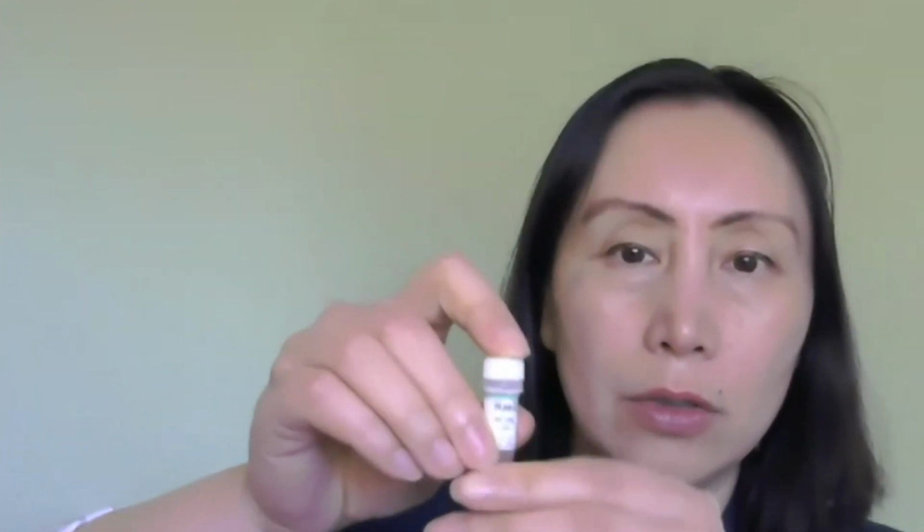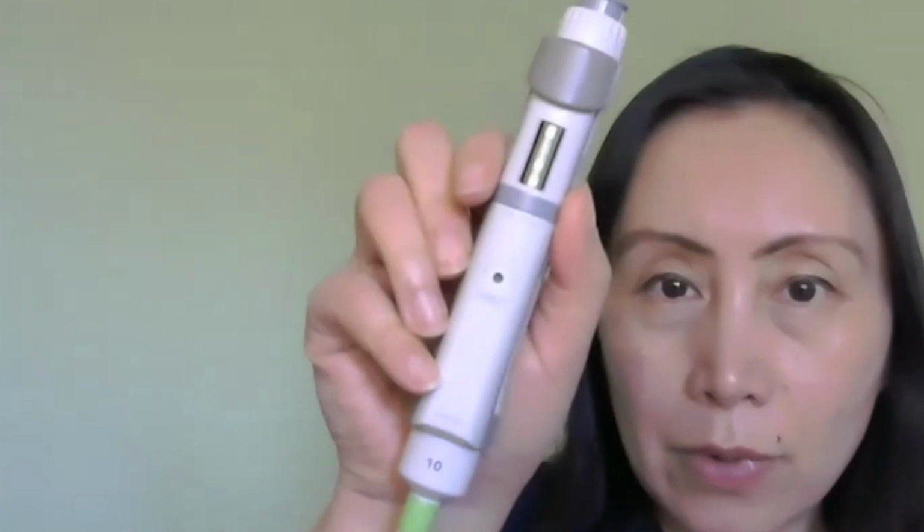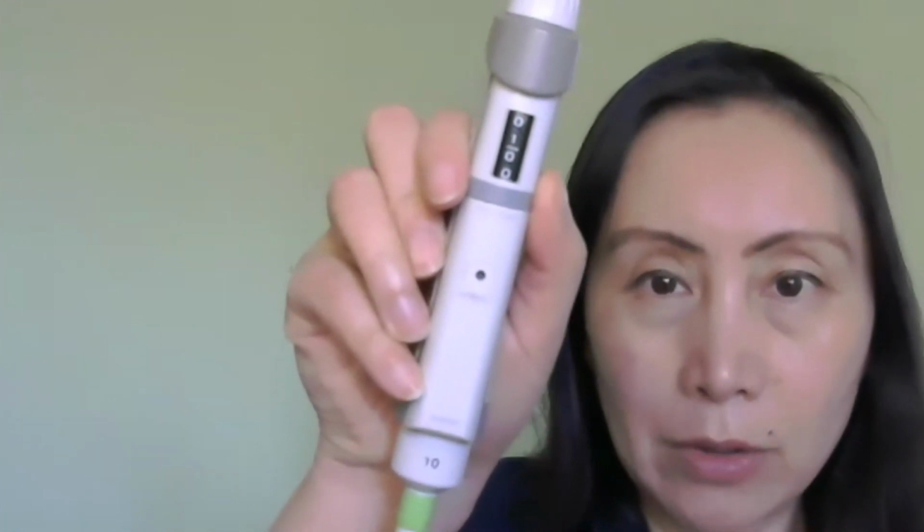All right, so here is the enzyme I'm going to use to do the digestion. It's HAE3. I only need 1 microliter, so the number you're looking for here is 0, 1, 0, 0. Okay, I'm getting there. All right. Ta-da, that's 0, 1, 0, 0, 1 microliter.